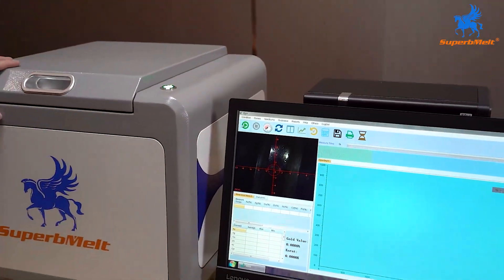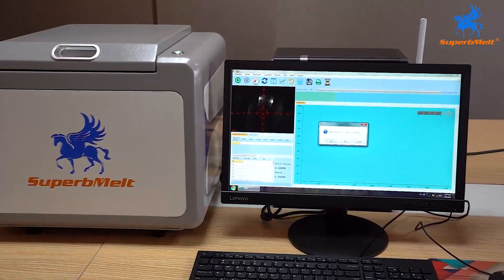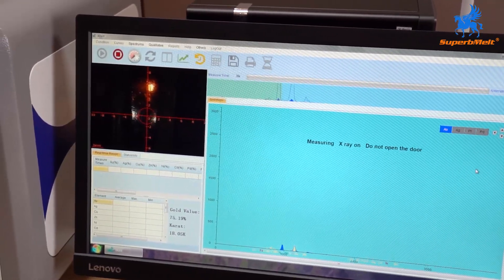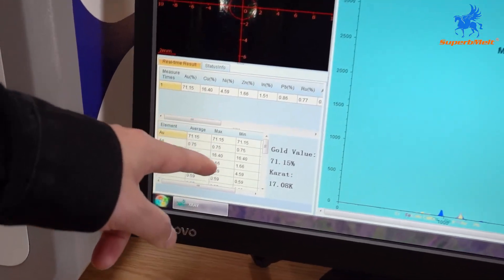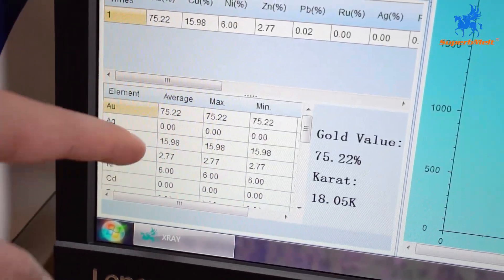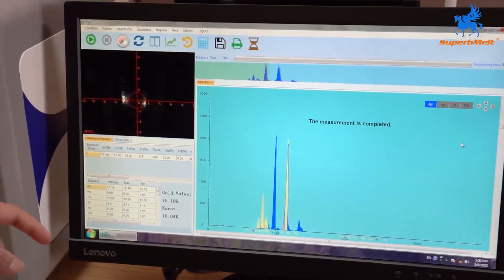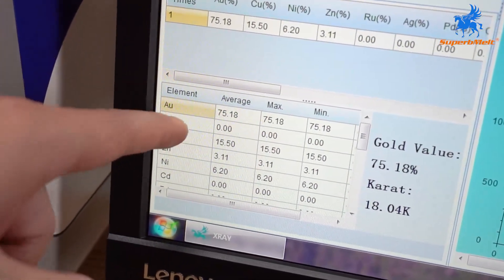This next model is higher accuracy and tests more elements. Let's start the test — it will also take 30 seconds. The real numbers will stabilize after 30 seconds; for now the reading is still fluctuating. This machine's accuracy is within 0.03%. The result shows 75.18% gold, similar to the previous model — confirming 18 karat.